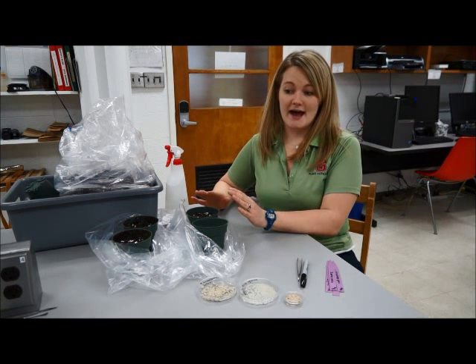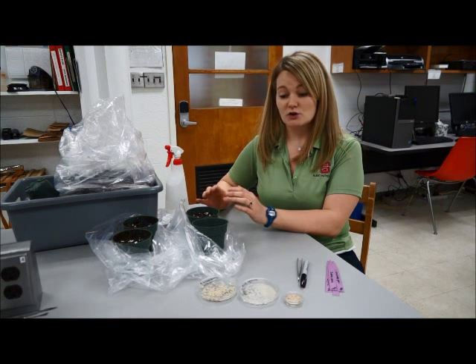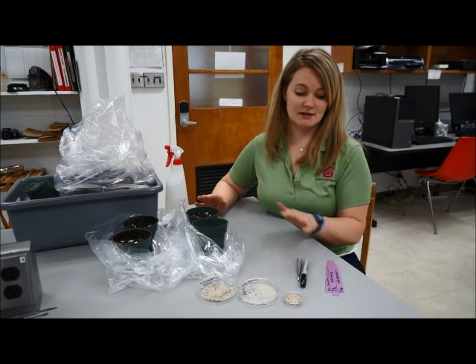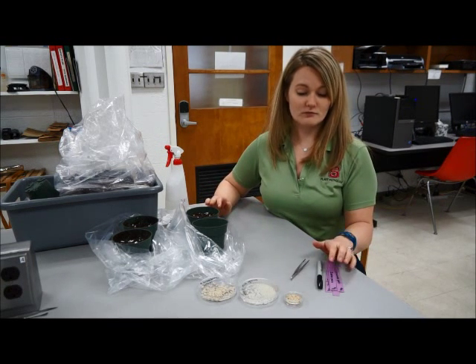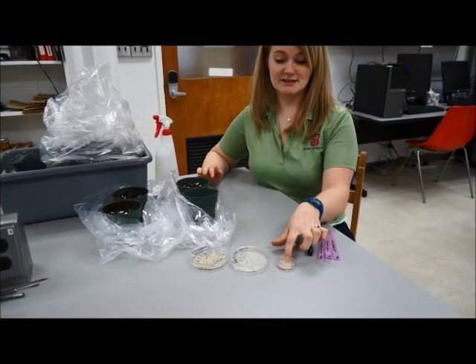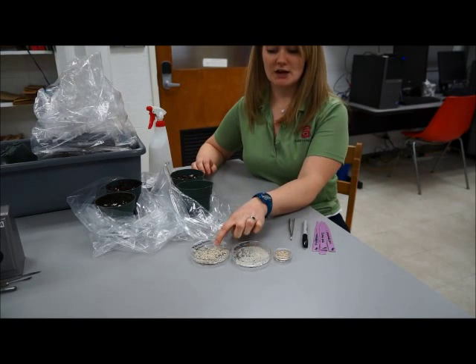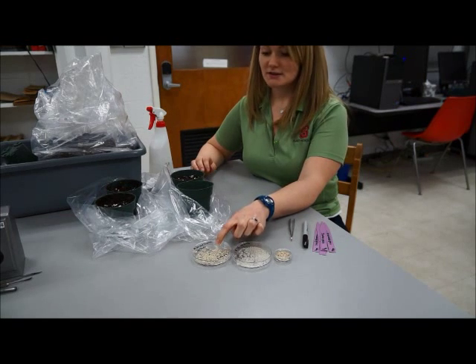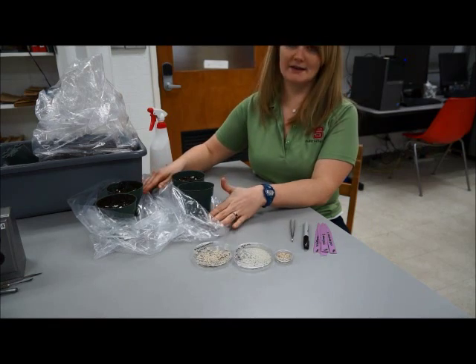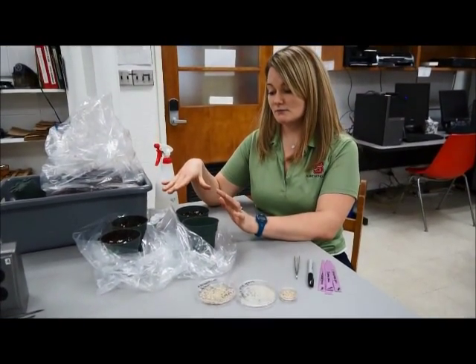In the experiment today, we will look at different levels of inoculum as well as controls and negative controls. The supplies you're going to need are: a marker, pot labels, forceps, cucumber seeds — eight per pot — sterile rice grains, rice grains inoculated with Rhizoctonia solani, four pots four inches in diameter, two bags to place your pots in, and potting media.